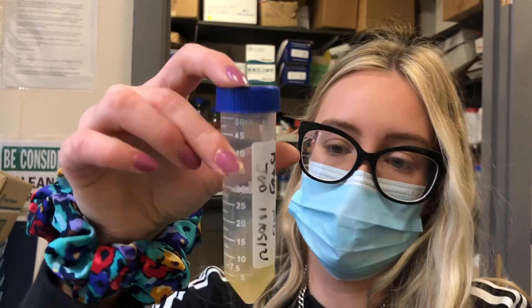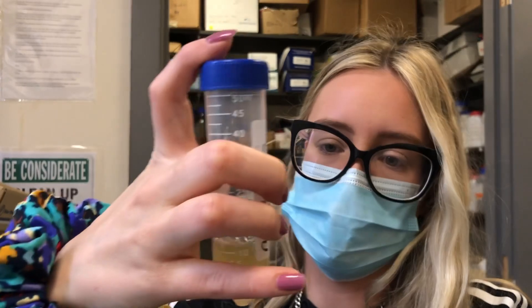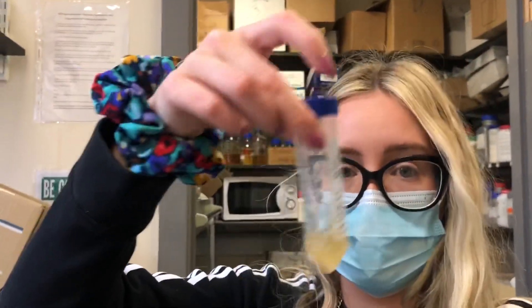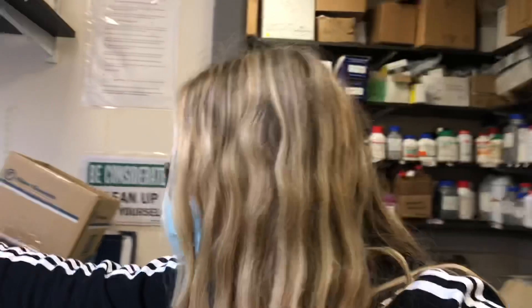The reason for this is that my bacteria are aerobic bacteria, which means they need oxygen to grow. So if I'm increasing the surface to volume ratio, it means the surface of the culture is getting access to more oxygen. And also when it's spinning, it can mix better - if you imagine it in a smaller tube and you're trying to mix it, there's not really much air getting into contact with the surface of the liquid. So far so good.